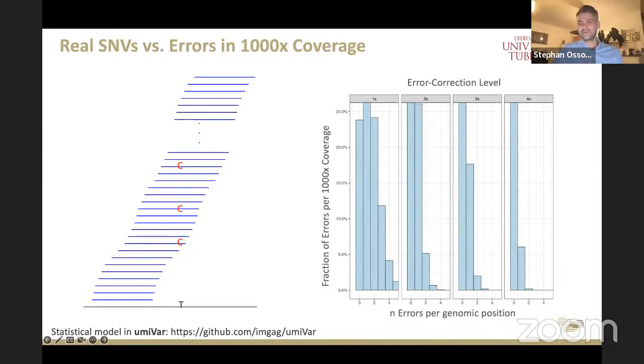So when you see, at that correction level, a variant that only shows up in 3 out of 1000 reads, you can already trust it. It is very likely a true variant. So we would again try to reach the 3 or 4x level. We can still use these reads because our model will automatically recognize them as more error prone and will automatically require more changed reads.